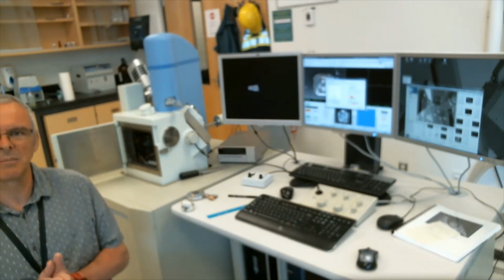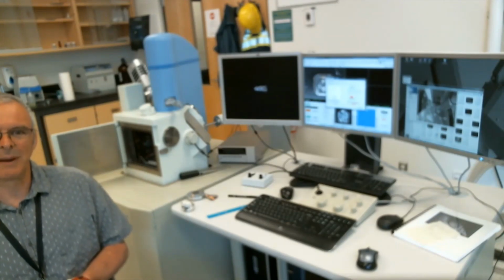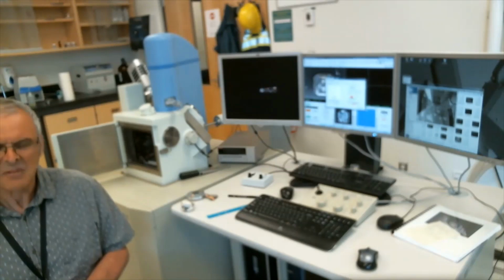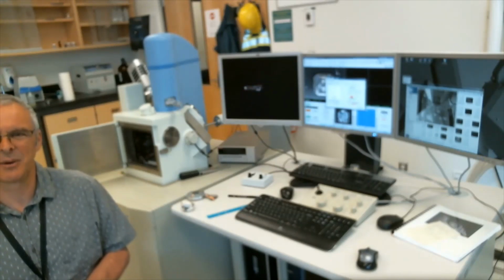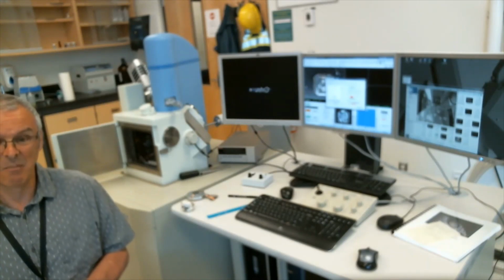Problem is when we're looking at minerals, we don't get good backscatter images with that low voltage. And secondly, with low voltage like that, we're not going to generate X-rays, which we'll talk about later. We can't generate X-rays. We need a much higher beam energy to generate X-rays.